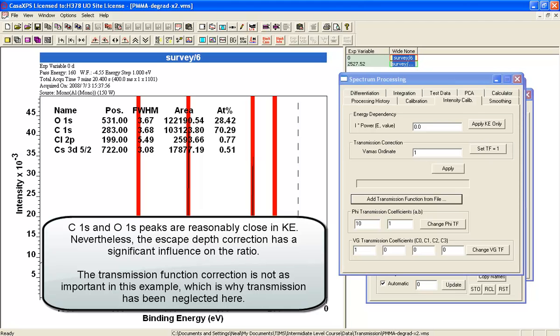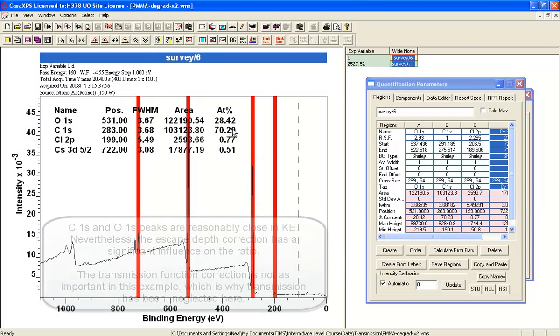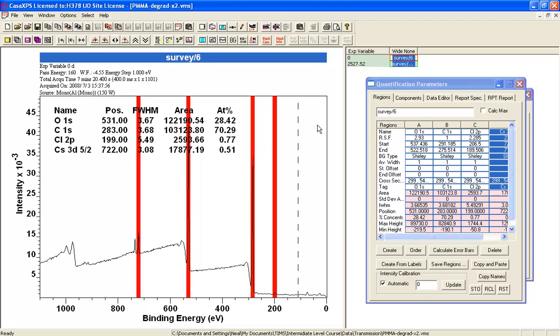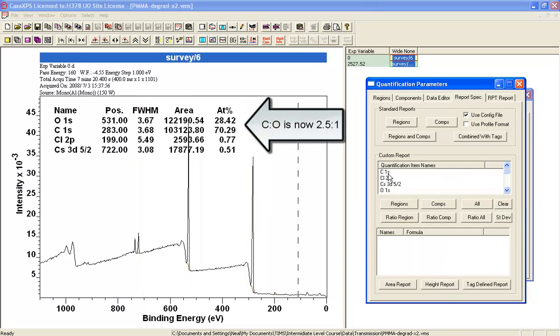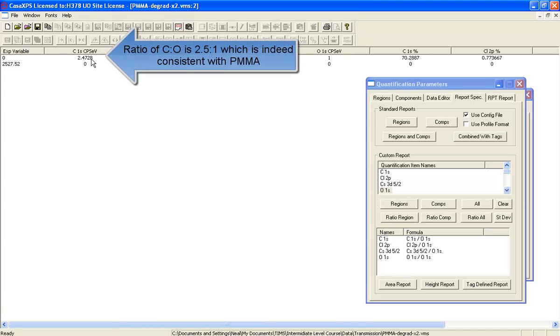You can see the transmission function was updated. Now the ratio you see here, simply by correcting these Schofield cross-sections by an escape depth correction, I've improved the quality compared to what we expect for PMMA. Looking at the ratio of carbon relative to oxygen, with oxygen as unity, that's what we expect for the ratio.